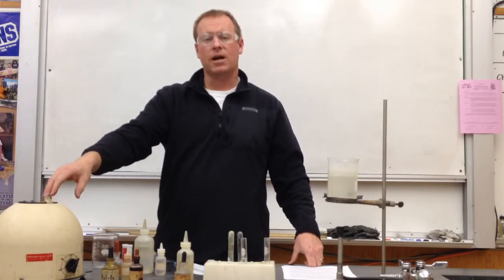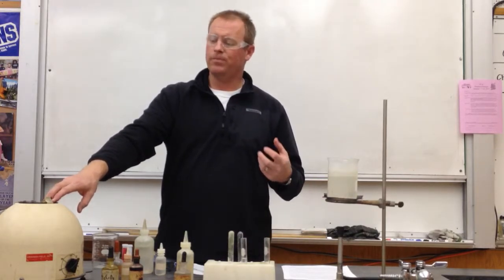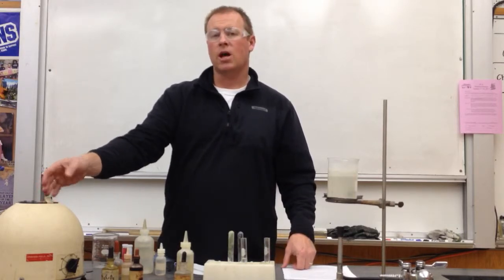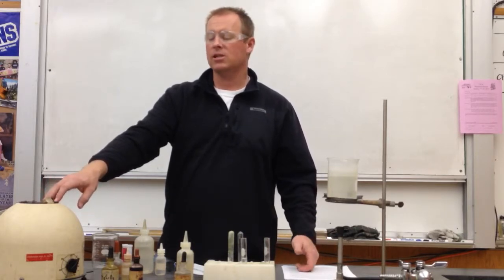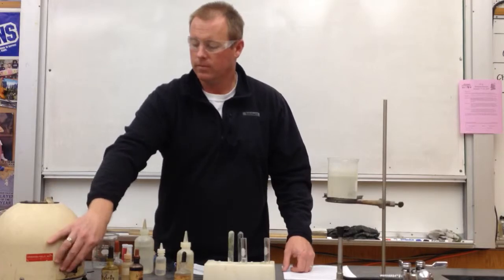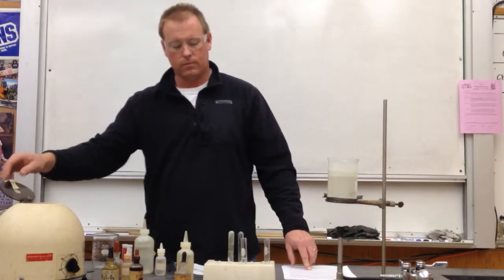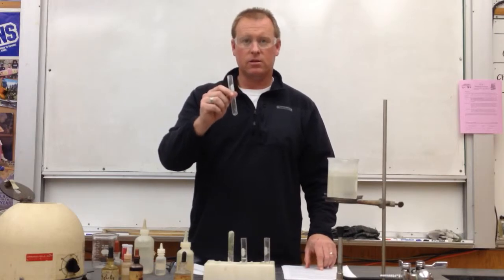Now, like I said, this precipitate is not nearly as dense. It would take gravity longer to bring that precipitate to the bottom of the test tube. Even the centrifuge is going to need to be run for a little bit longer in order to get that precipitate all the way down to the bottom of the test tube. So if I would normally let this run at top speed for 5 seconds or so for other types of precipitates, I may let this run for a little bit longer, 15 or 20 seconds, maybe 30 seconds, trying to get all that precipitate gathered down at the bottom of the test tube. So we're going to decant and save the precipitate for step 9.